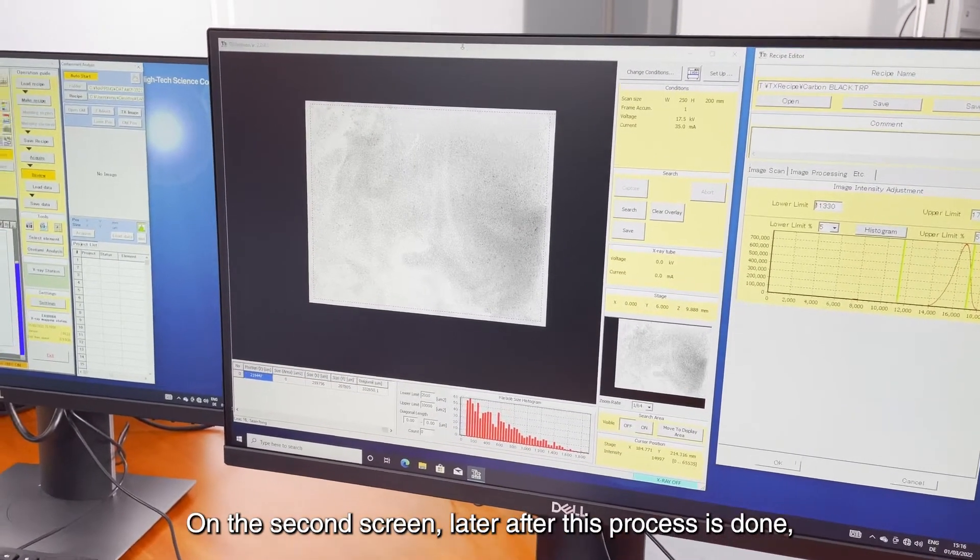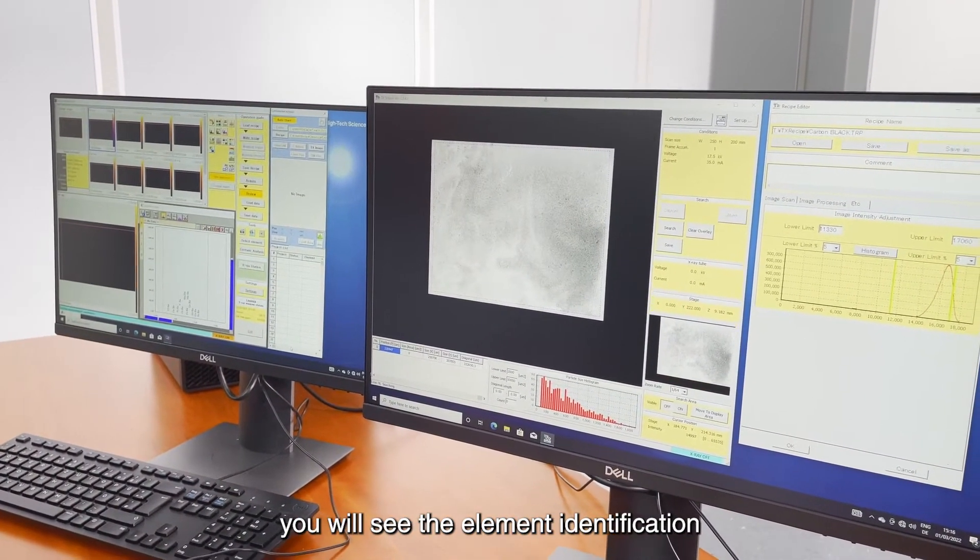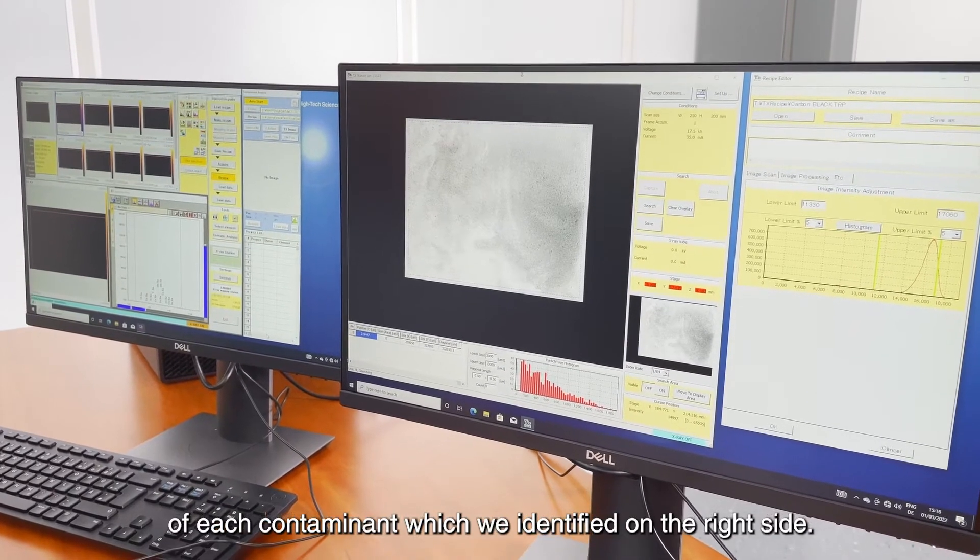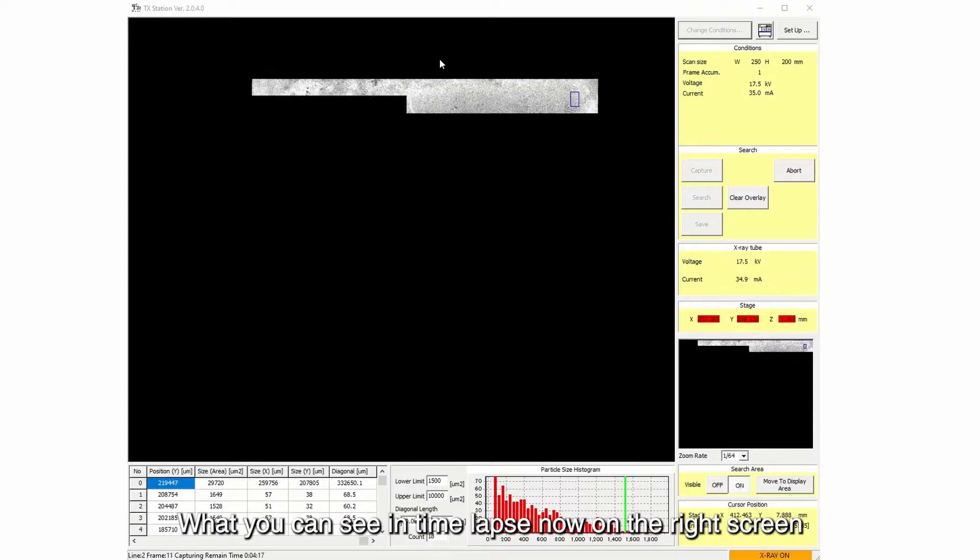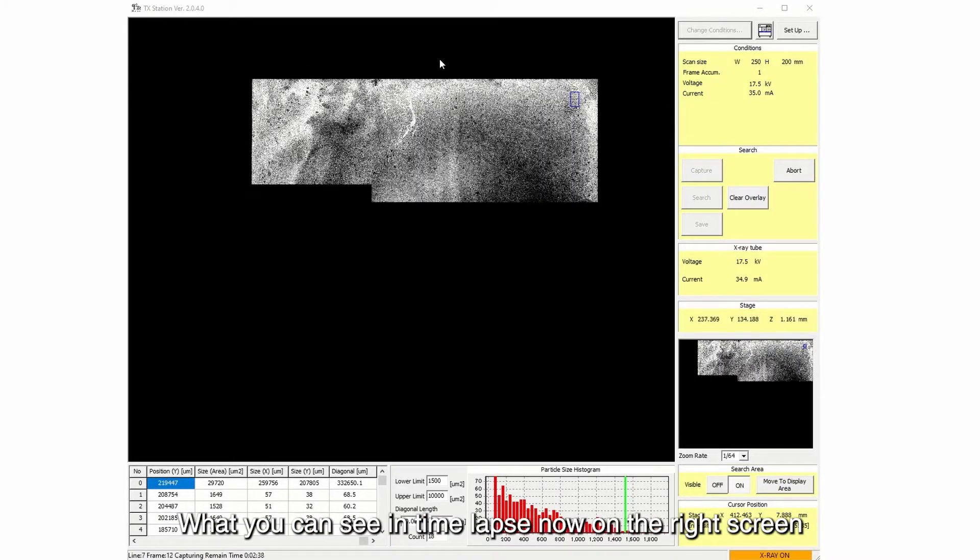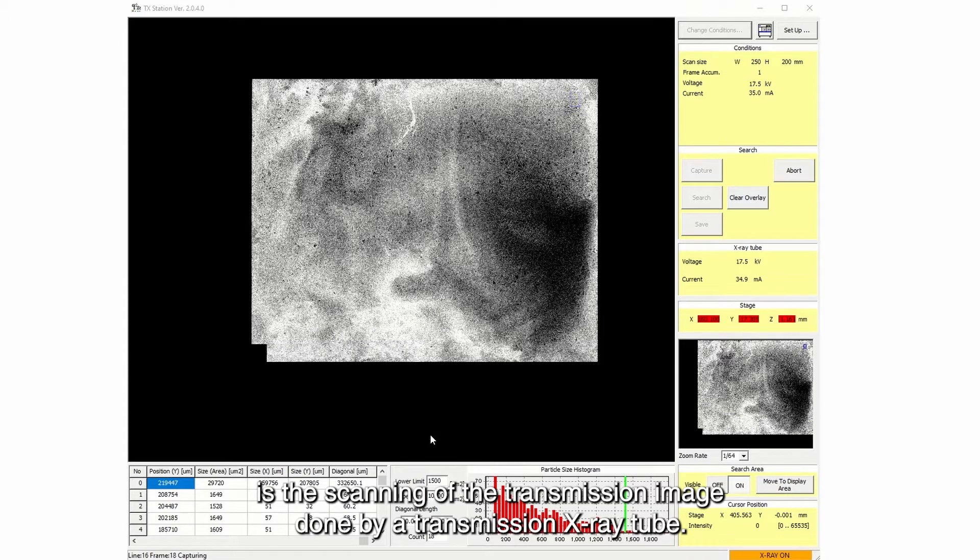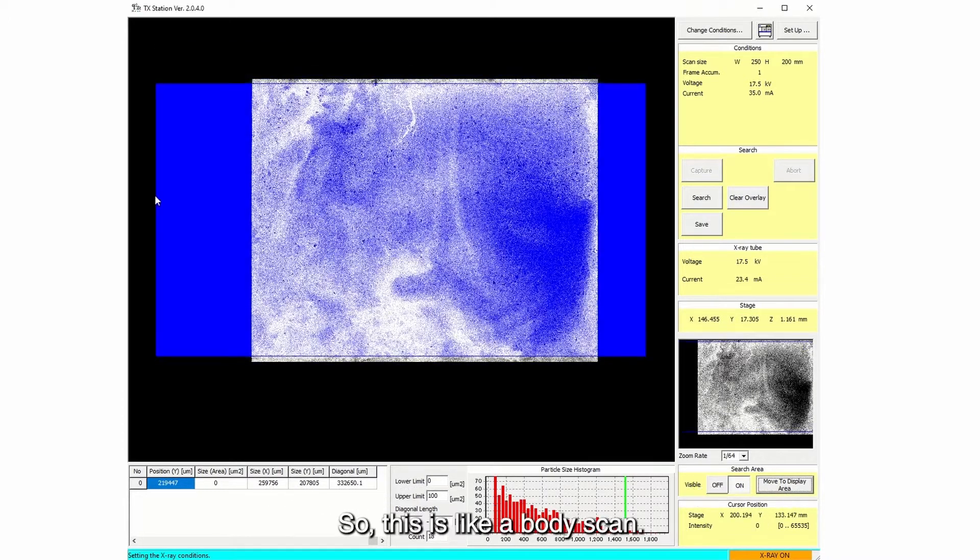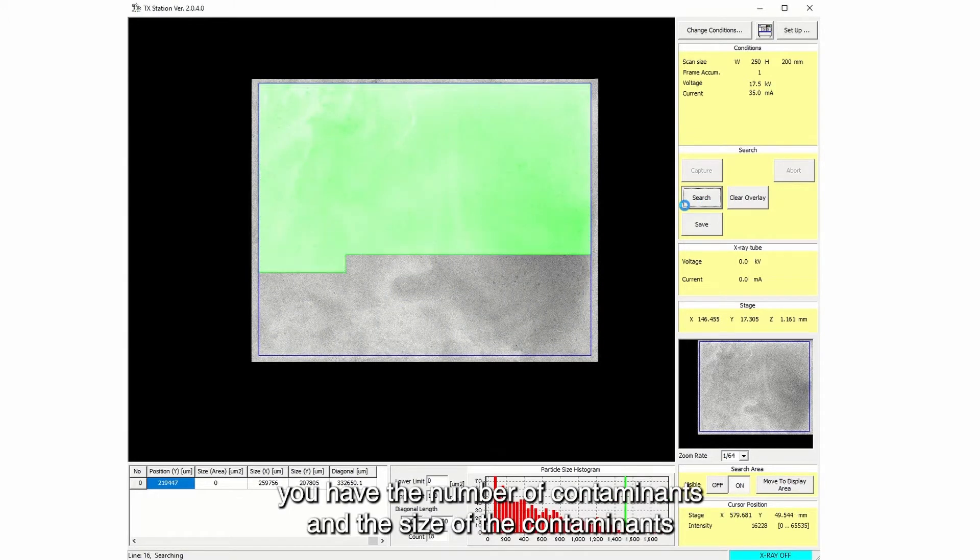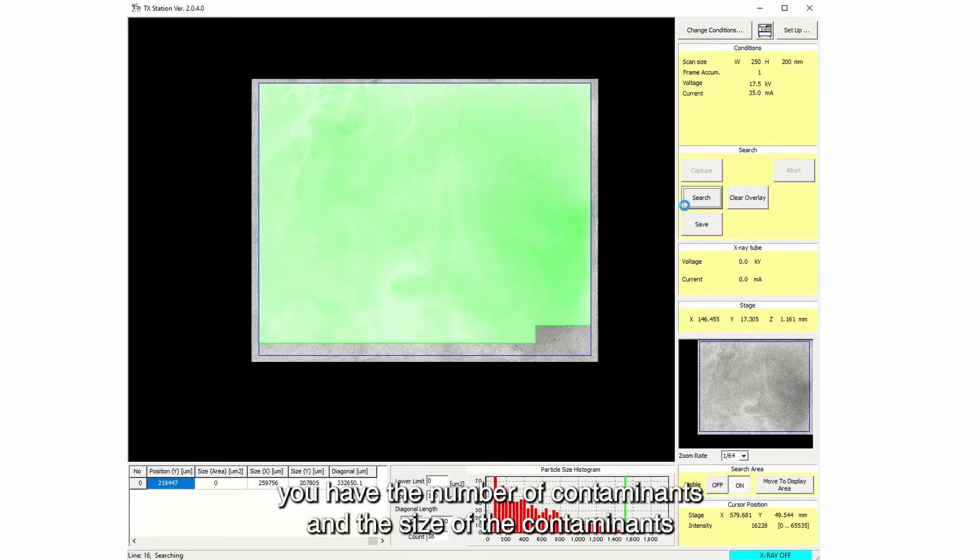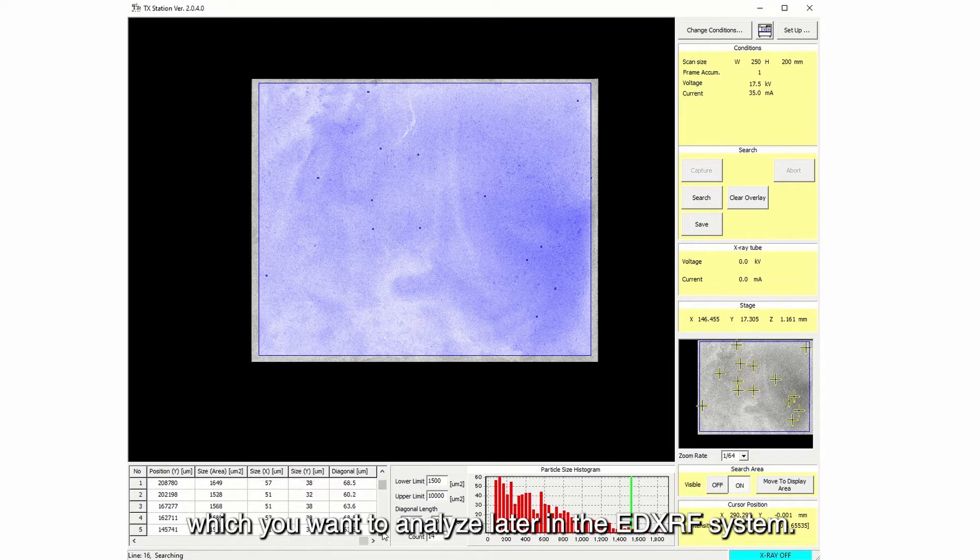On the second screen later after this process is done you will see the element identification of each contaminant which we identified on the right side. What you can see in time lapse now on the right screen is the scanning of the transmission image done by a transmission x-ray tube. So this is like a body scan. Here at the end of the scan you have the number of contaminants and you have the size of the contaminants which you want to analyze later in the EDXRF system.